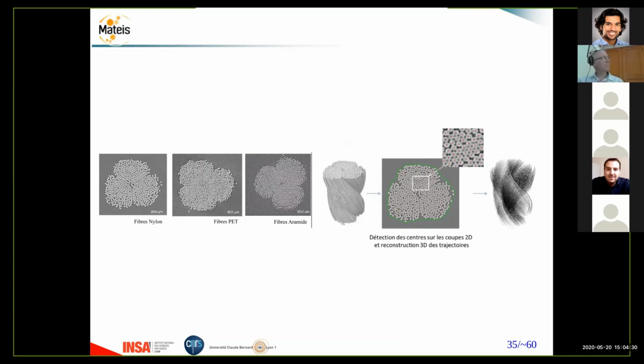Yes, hello, do you hear me? Yes, I hear you. Okay, thank you very much for this presentation. Actually, my question will be more technical. It's regarding the foam gypsum. The first question is how to choose or to adapt the voxel size if there is a need to perform DVC on porous materials according to the pore size.